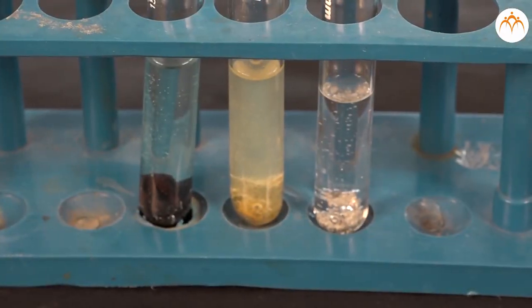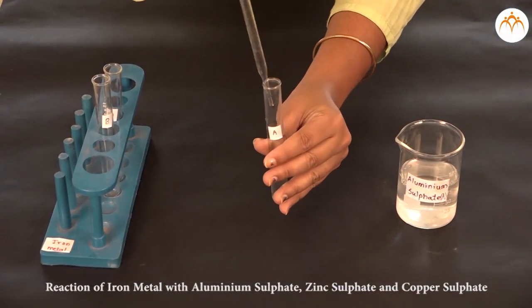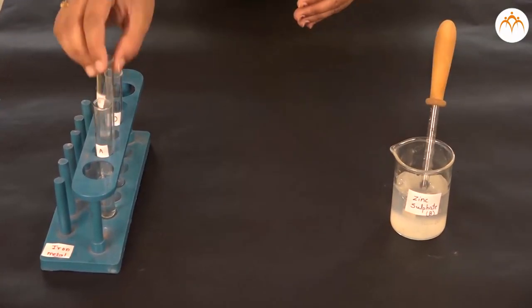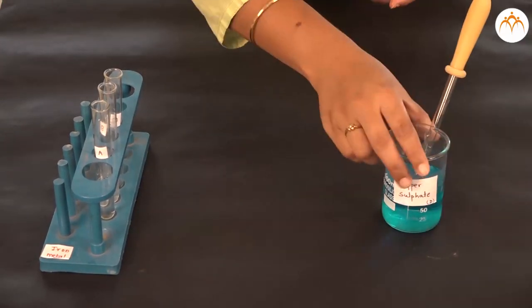Observe the changes. Take copper filings and add to aluminum sulfate, zinc sulfate, and ferrous sulfate solutions. Observe the changes.